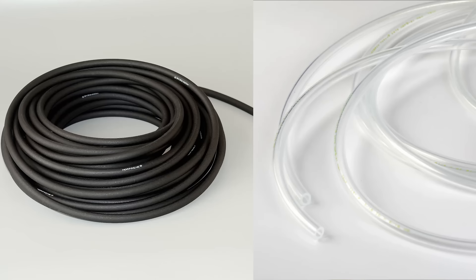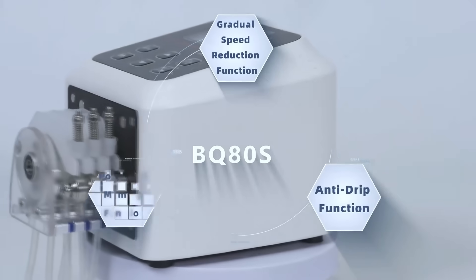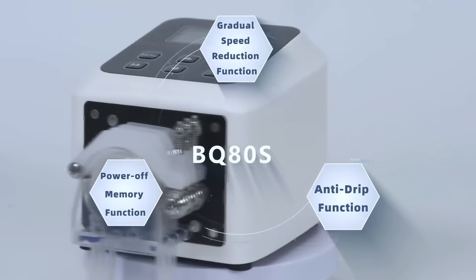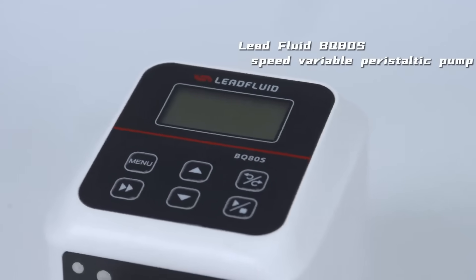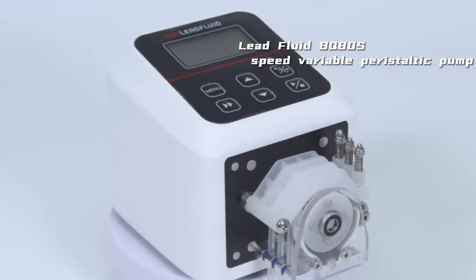It comes with food and medical-grade tubing to meet higher industry standards. The BQ80S also features functions for gradual speed reduction, anti-drip, and power-off memory. Choose the Lead Fluid BQ80 Speed Variable Peristaltic Pump and embark on your journey to efficient work.